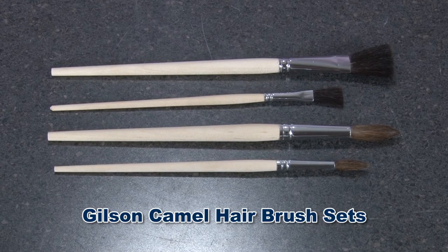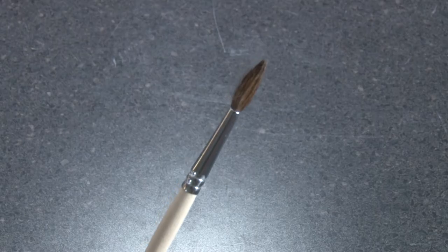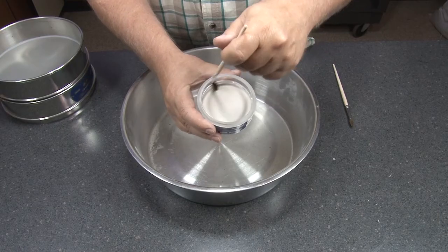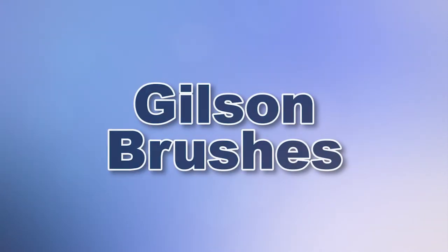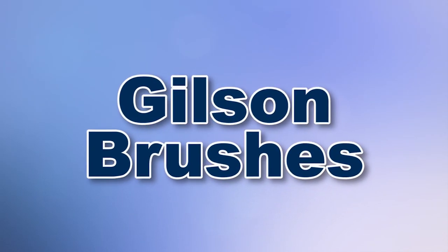Gilson also offers camel hair brush sets for cleaning delicate precision electroform sieves and handling cleanup of fine powders. This set of four comes with two round tip and two flat tip brushes that are all set in solvent resistant cement. With Gilson's complete family of brushes offering a wide range of performance features and capacities, Gilson has the right equipment for your laboratory needs.